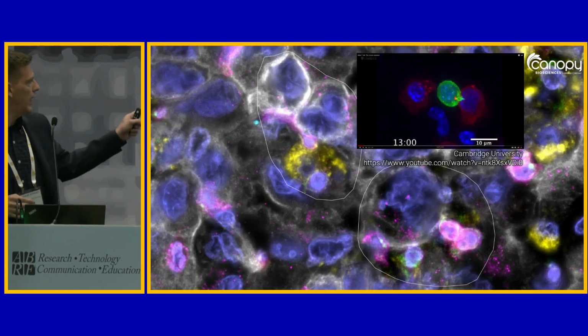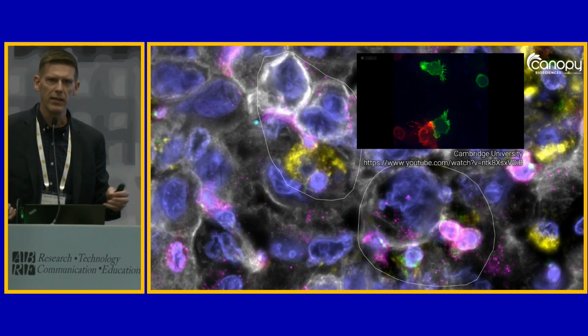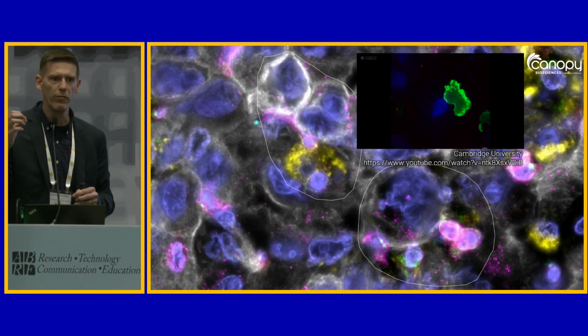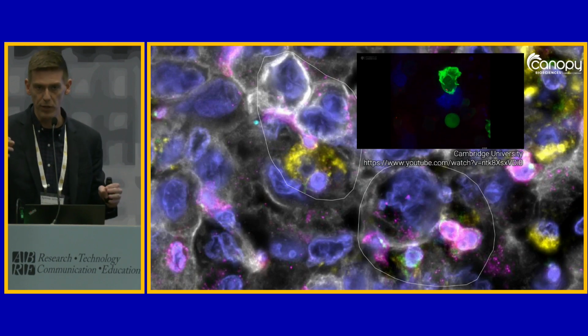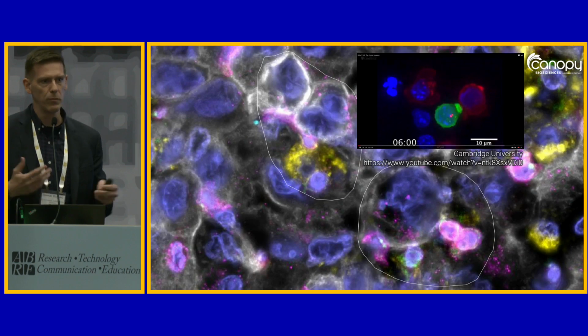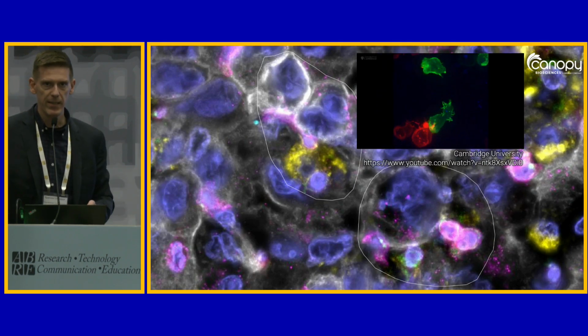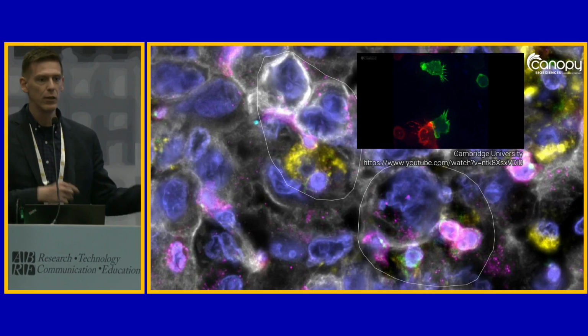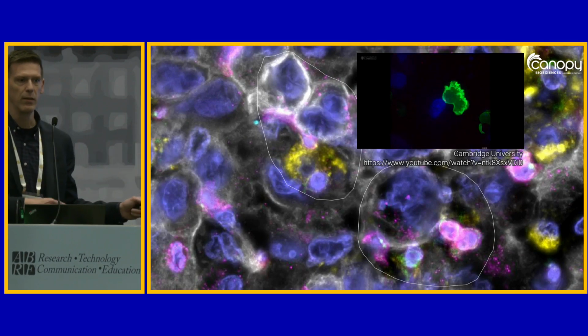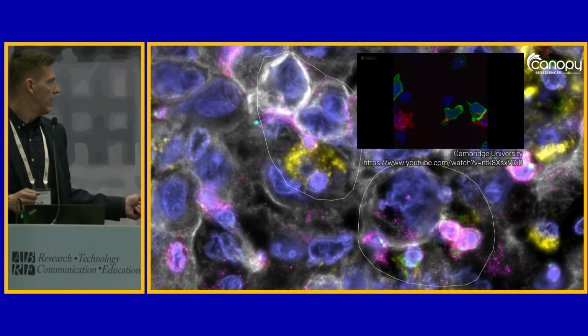In contrast, if I take a look at those 2 T cells on the left, they're not doing much of anything, and they're also balled up. So I can see through that morphology that there's probably some sort of suppression, maybe some immunosuppression going on, without having to necessarily stain for PD-1 or PD-L1 or look at those checkpoint inhibitors. But here's what's really cool about CellScape. If that's my question, I can go back, stain that same sample for PD-L1 and PD-1, and actually verify whether that's happening or not.